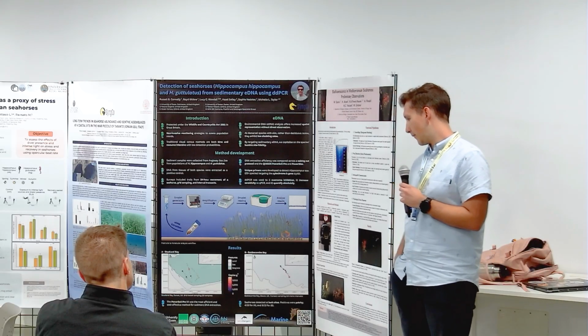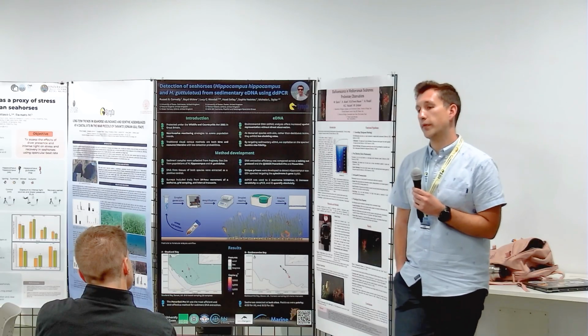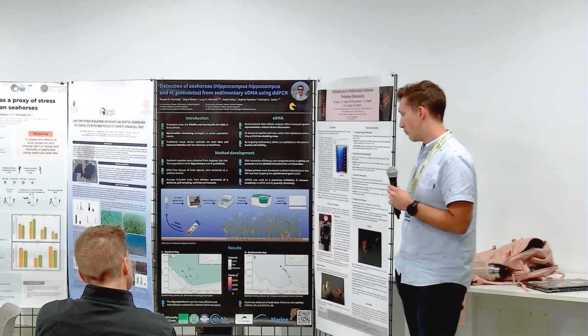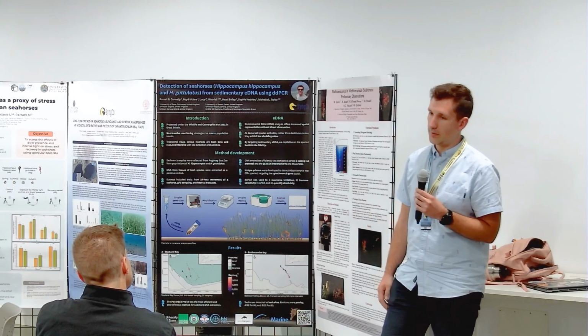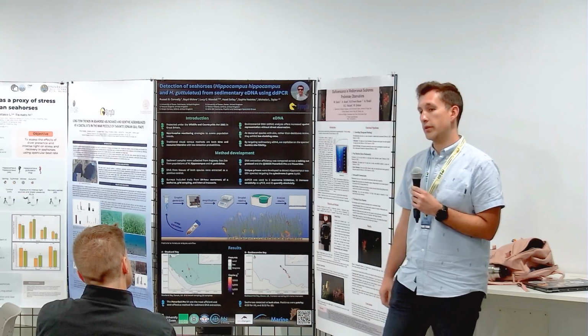Very good questions. The kit that we're using is 0.25 grams worth of sediment, so it's very, very little. Mostly we've tried to take around 8 to 10 mil, just so that we have enough as a bank for future preservation. But it is only 0.25 grams of sediment that's extracted from.